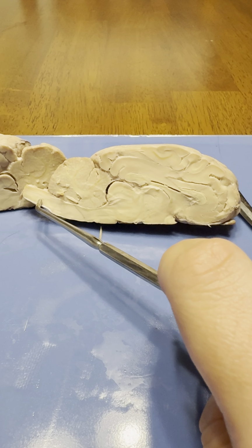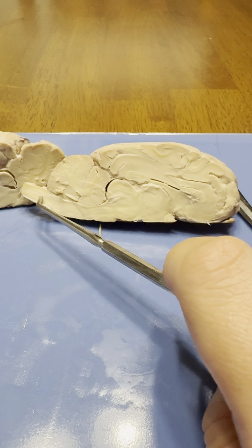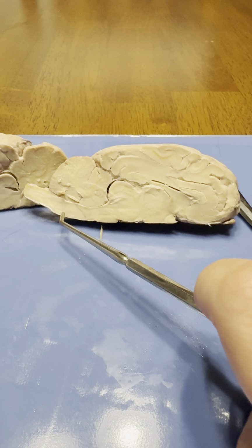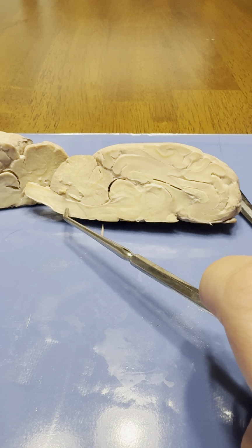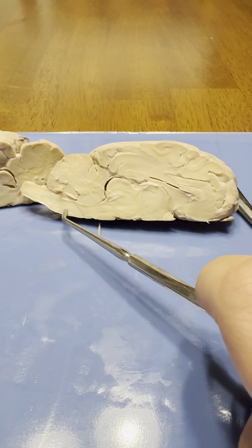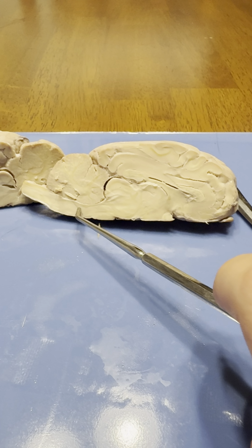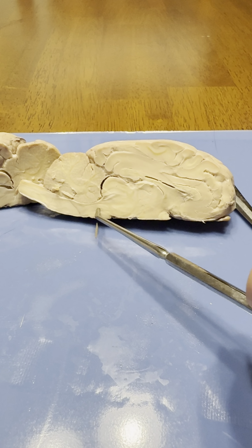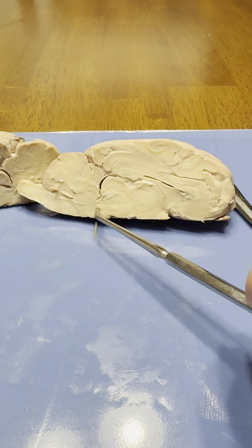Here is the spinal cord, which is bundles of nerve fibers. And then you have the medulla, which is the most inferior part of the brainstem. And then you have the pons, which contains nerve tracts. And then you have the midbrain, which is the small central part of the brainstem.